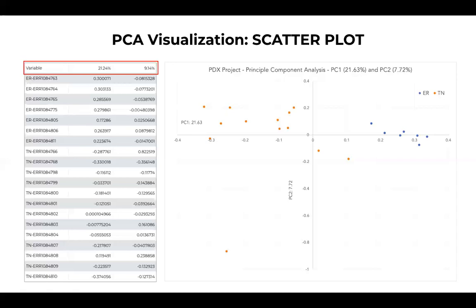Sorry about that. So as a result of principal component analysis, we will get a table of values for each principal component with each object or sample in our data set. So you get these sort of values, and the columns will also have a percentage. Here you can see in the columns, you'll see a percentage. That is the amount of data this principal component has captured. So PC1, PC2, PC3, there are different components that capture the whole data.